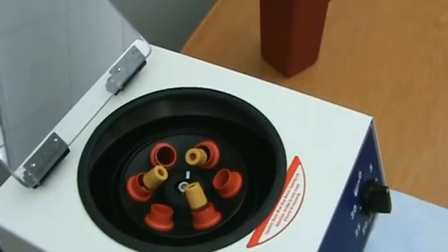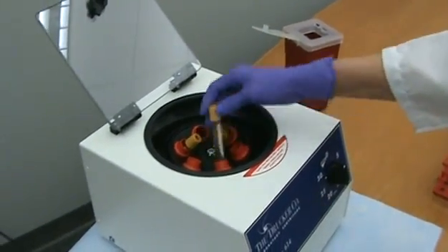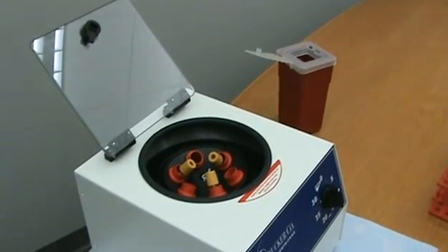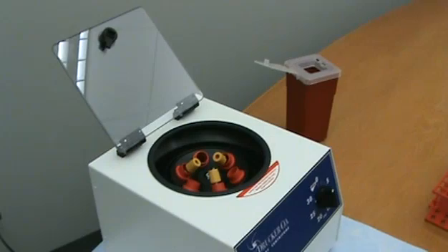If you have only one tube to centrifuge, then you will need to prepare a balanced tube using water to match the specimen fill volume. In addition, the balanced tube should be of the same type and size as the specimen tube.